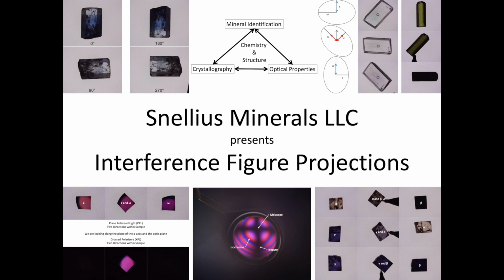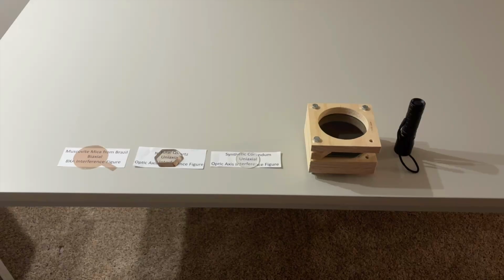Hi everybody! Today I wanted to make a video showing off some of the in-person demonstrations that I do to highlight optical mineralogy. Some of these demonstrations involve using a specially built polariscope in order to project interference figures. I've picked out some of the best ones to take a look at today.